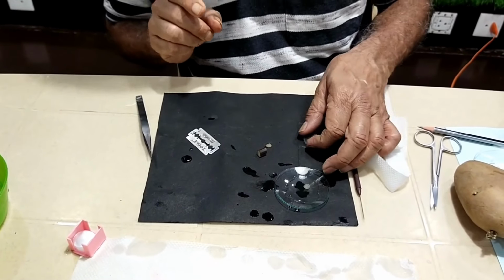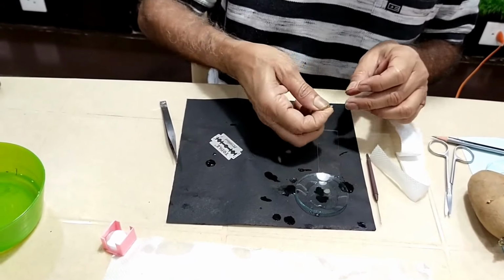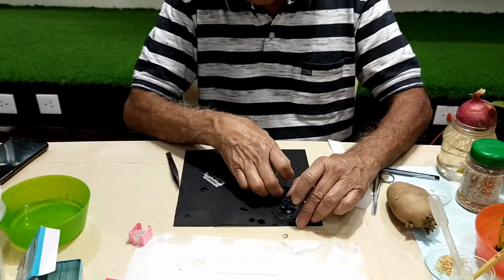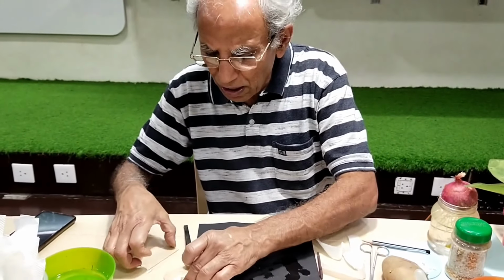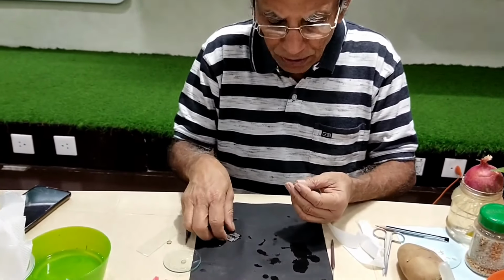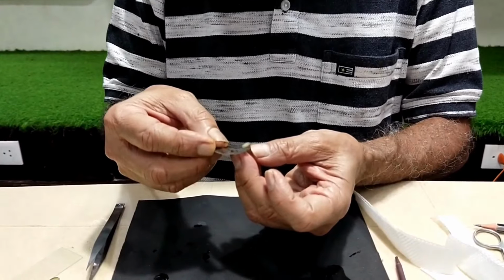I think I would like to change the section because I think it is not uniform, so I don't think it is possible to do it. So I'll take another section and once again repeat the things. Once again I'll take the section. I mean, the thinner the section, the better it is.